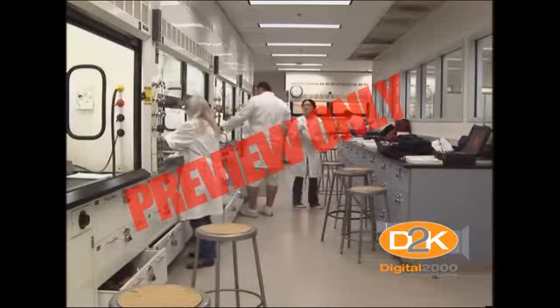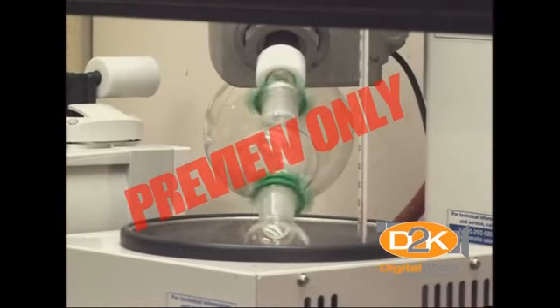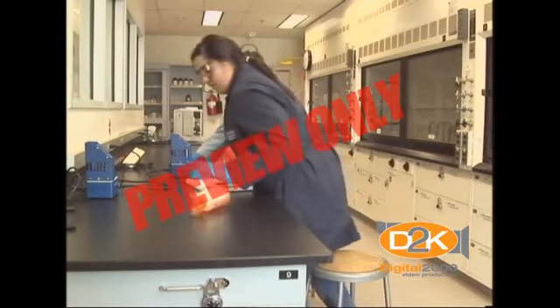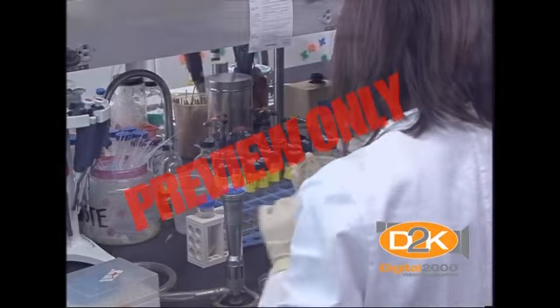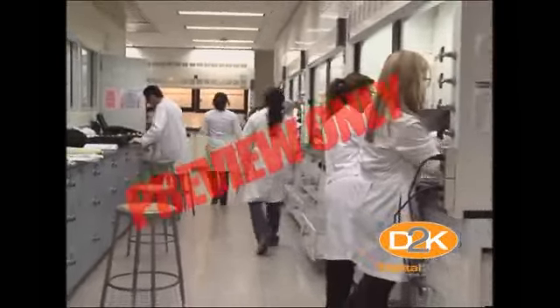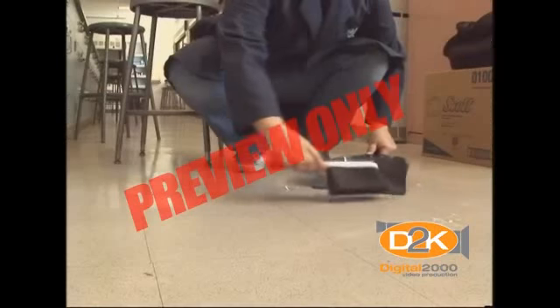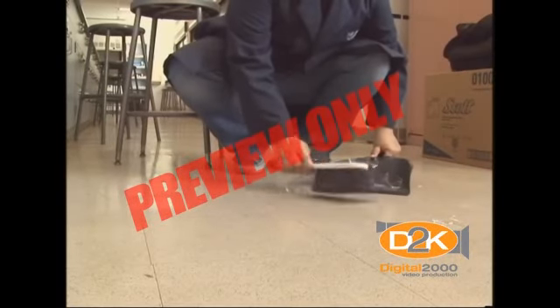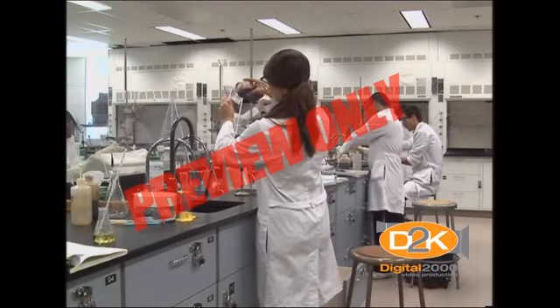Personal attire must be considered when working in any laboratory. Clothing, accessories, and hair may be entangled in equipment, caught in an accidental spill of a hazardous substance, or pass through flames unintentionally. Proper personal attire includes clothing that provides adequate coverage for the legs. Footwear should be closed-toed. Any footwear worn in the laboratory should provide adequate support and suitable traction for laboratory activities. Hair should be confined or tied back.